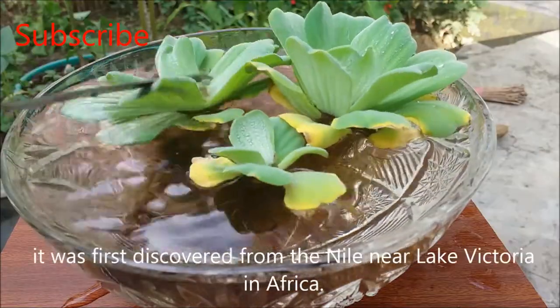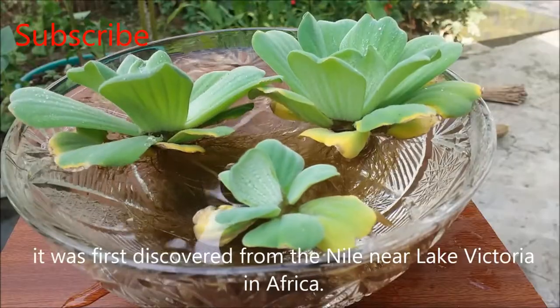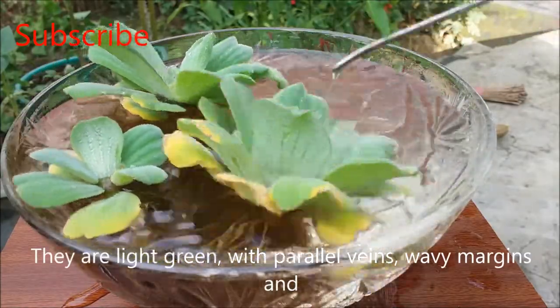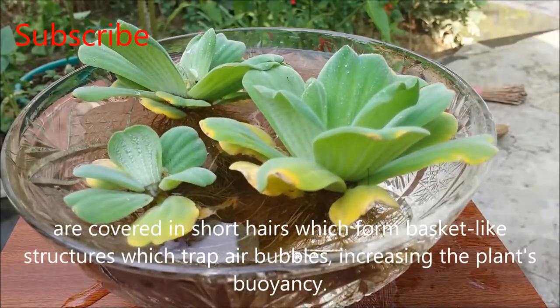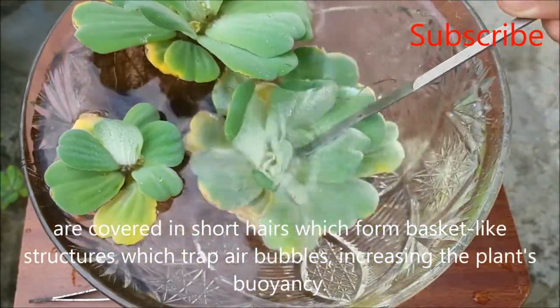It was first discovered from the Nile near Lake Victoria in Africa. The leaves are light green with parallel veins and wavy margins, and are covered in short hairs which form basket-like structures that trap air bubbles, increasing the plant's buoyancy.